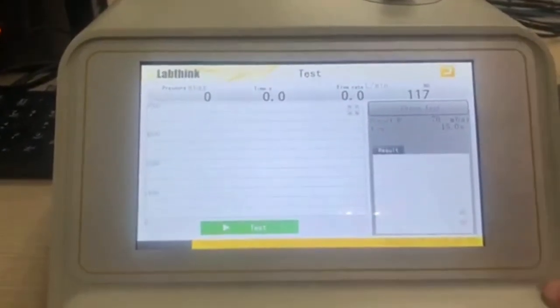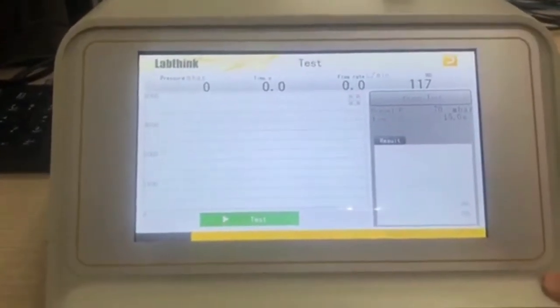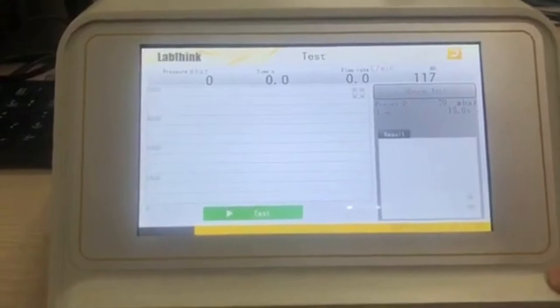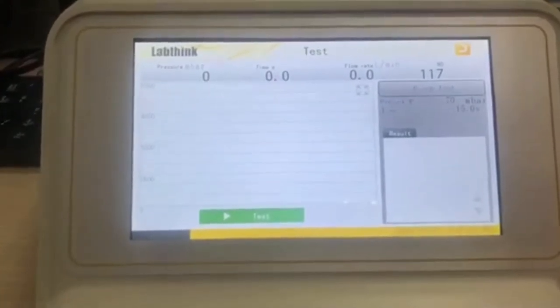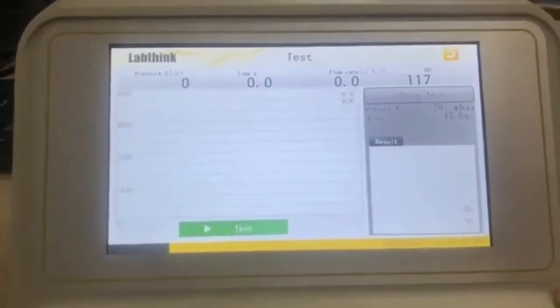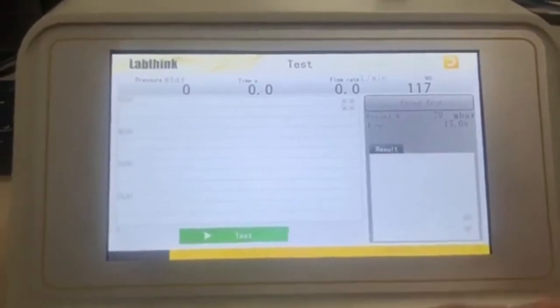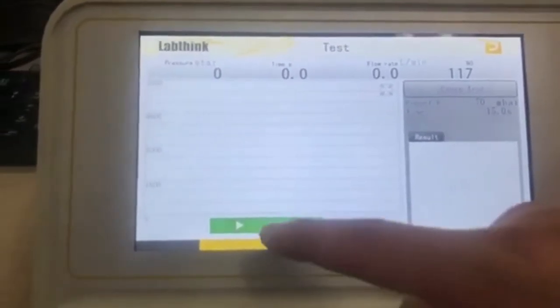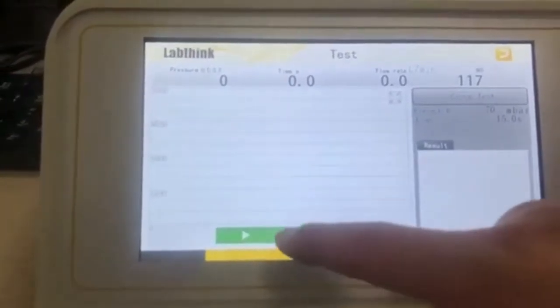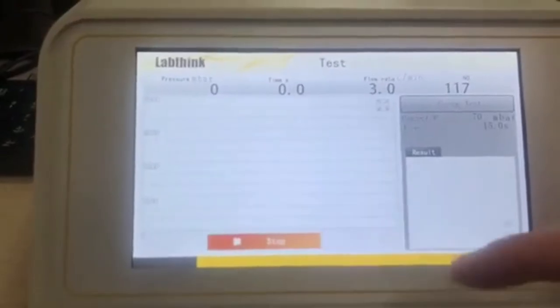Actually, it is very easy to use this tester. When we finish the parameter setting, we just press the button test and test will begin.